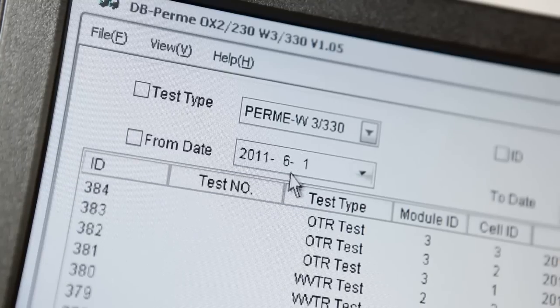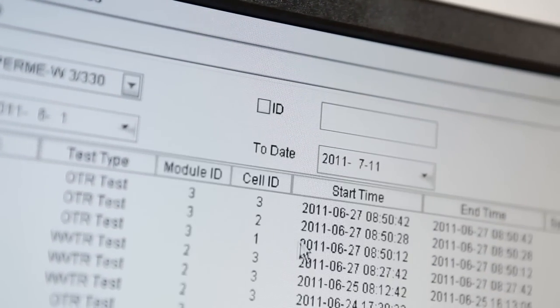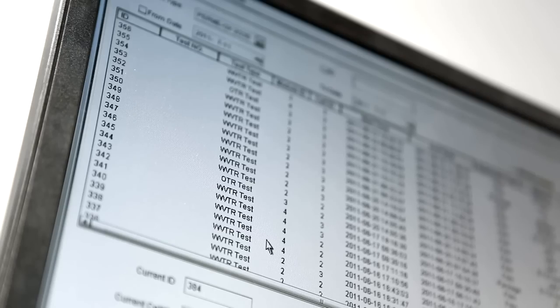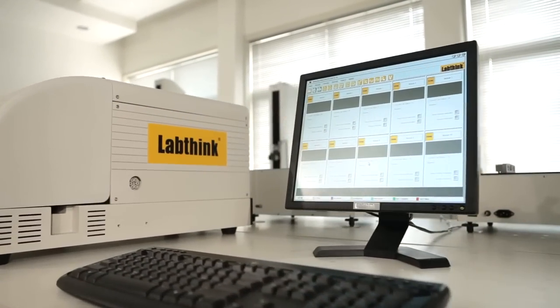It can carry out historical data search and comparison and re-analysis of raw data. This software can also operate and monitor the WVTR testing system and the OTR testing system at the same time.